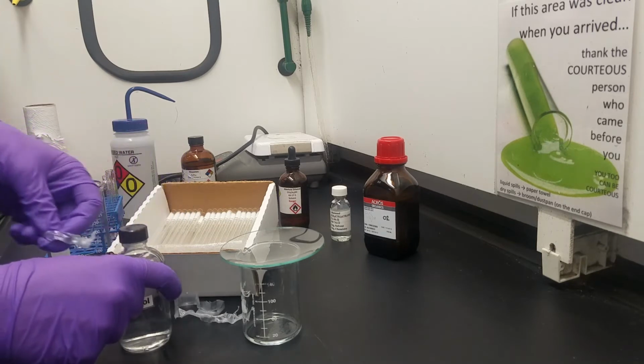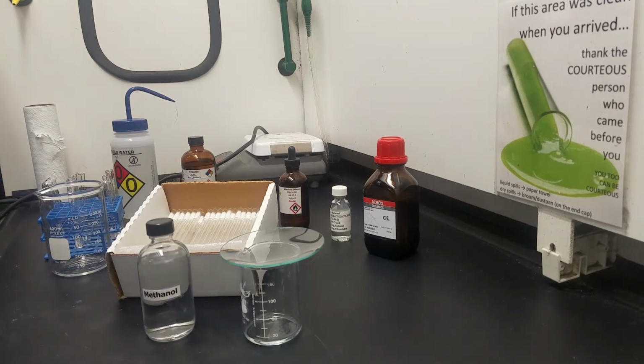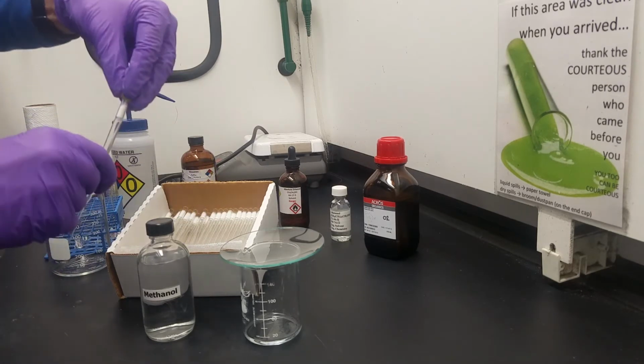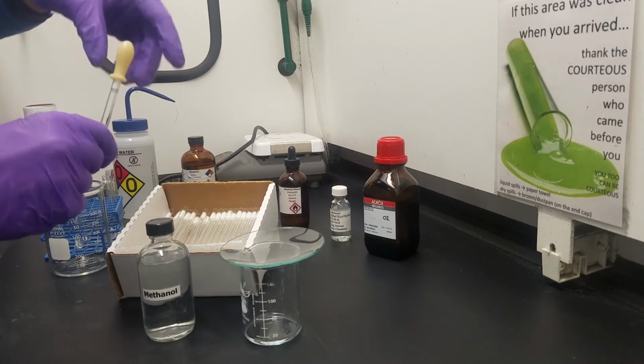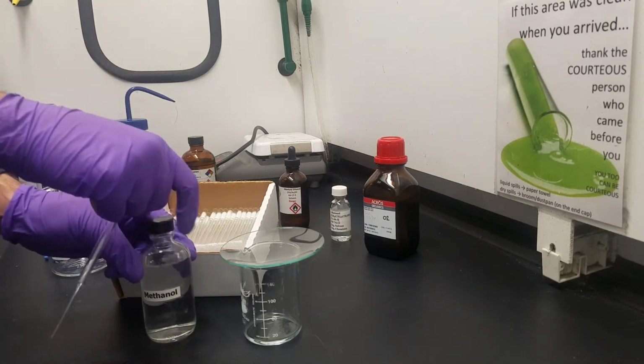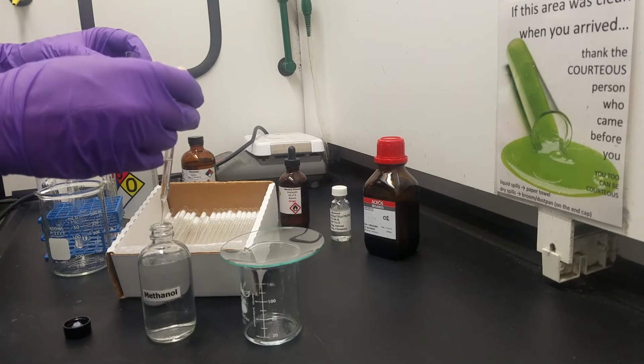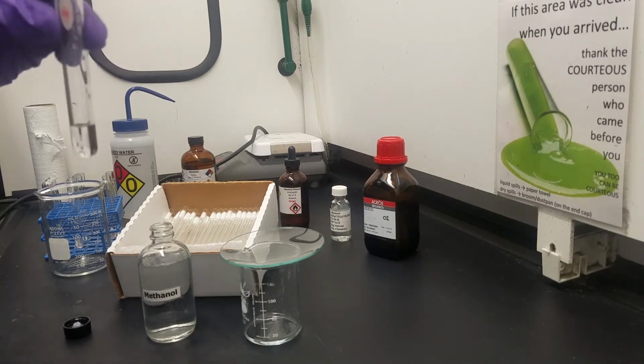In this case, you'll notice there's some parafilm wrapped around that. That helps to keep the chemicals inside the container, prevents kind of slow evaporation of those substances. Again, notice the pipette, keep the tip down as much as possible. See how I'm holding it to keep that tip aimed down. And we'll go ahead and start our mixing process.